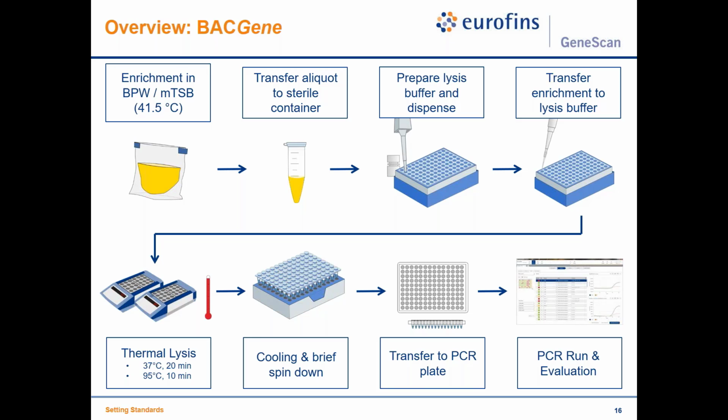Then there is a short thermal lysis of 30 minutes, after which you need to spin down briefly. As I mentioned before, this is just to get the condensate out of the top of the lids, and then go into the PCR and run it on your instrument.